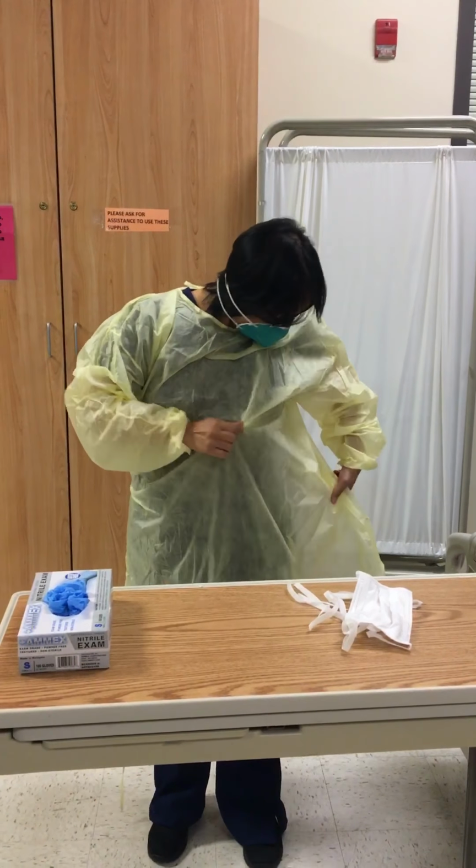So first you remove the shoe covering and the gown. So for the gown, one side, one on the left.